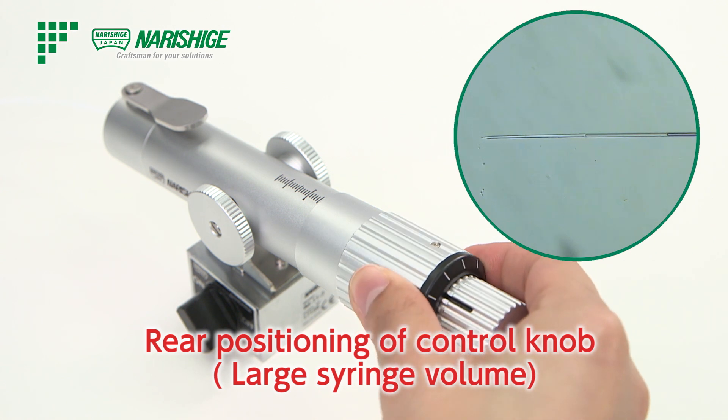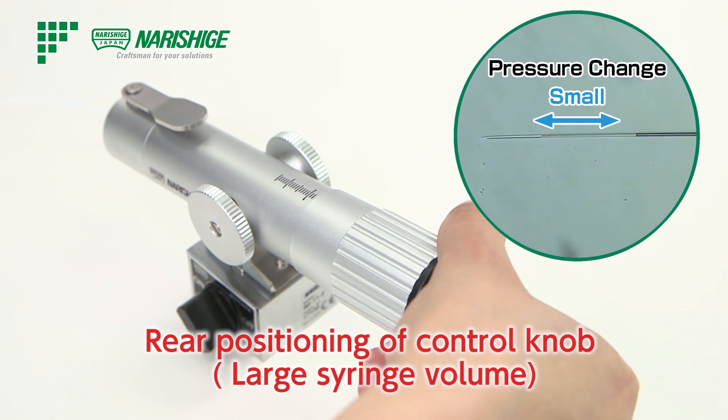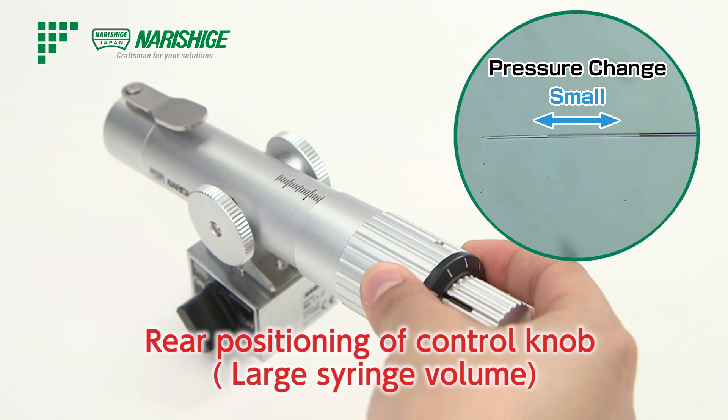When it is closer to the rear of the body, the syringe volume is larger and the compression rate is lower, which makes for a slower response.